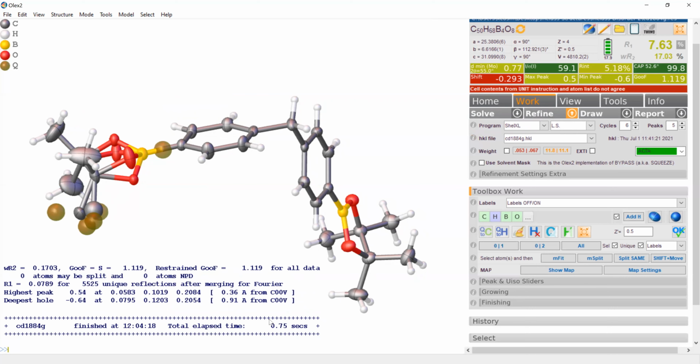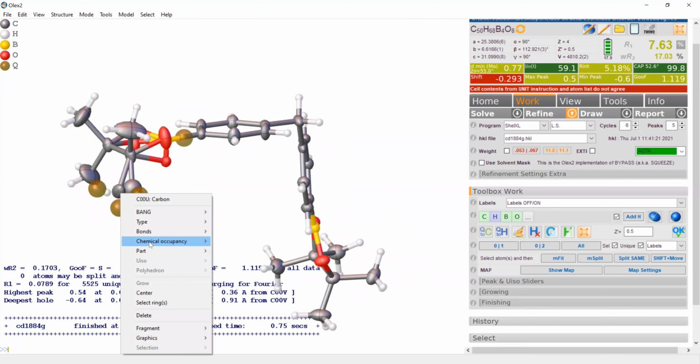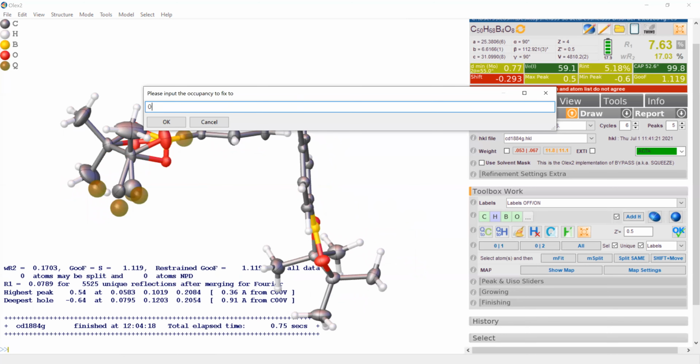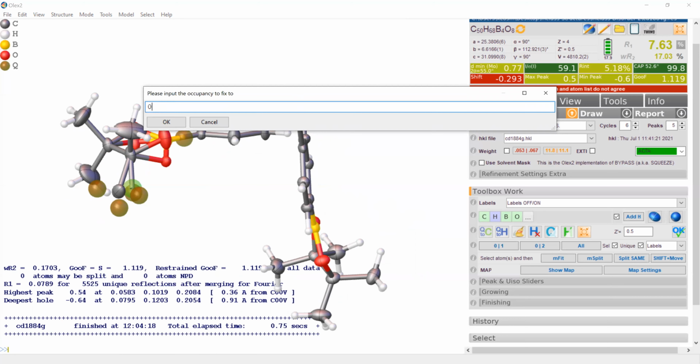And so let's see. Obviously this needs to be a little bit smaller. This is 40. This is 60. Maybe we do 65%. 35%.